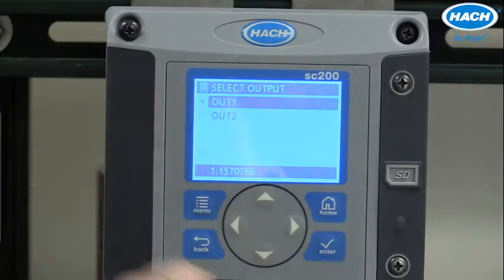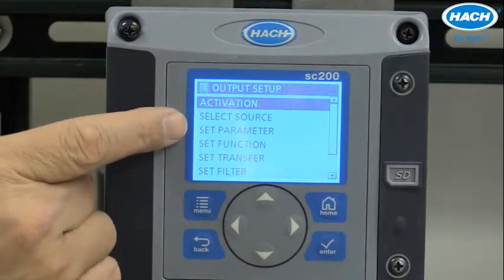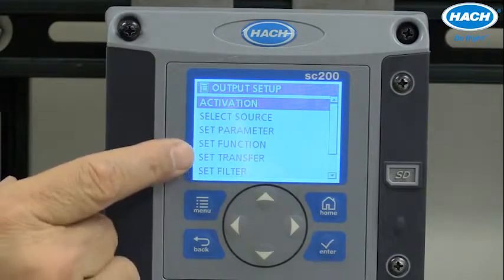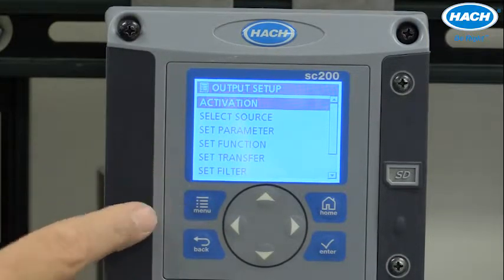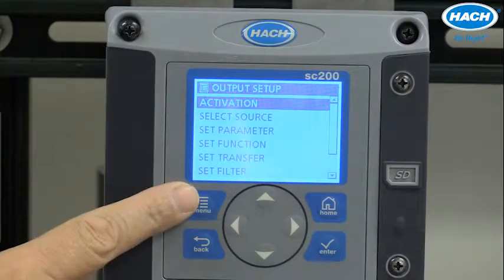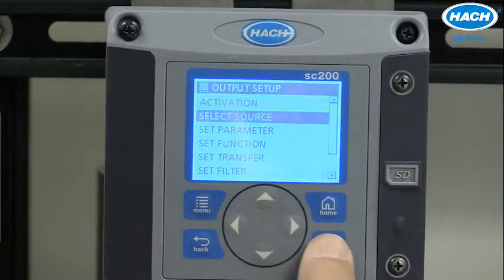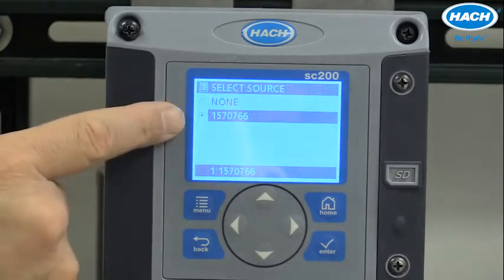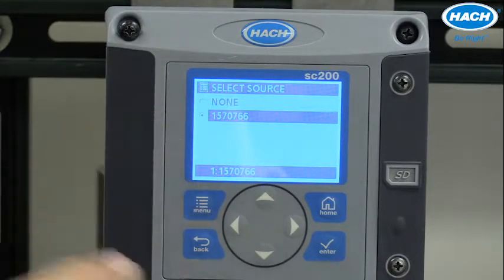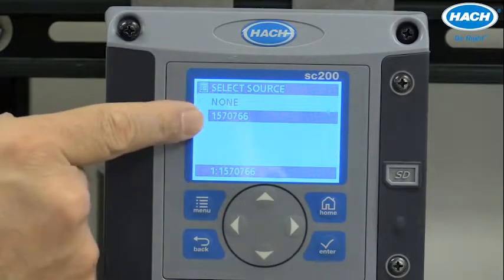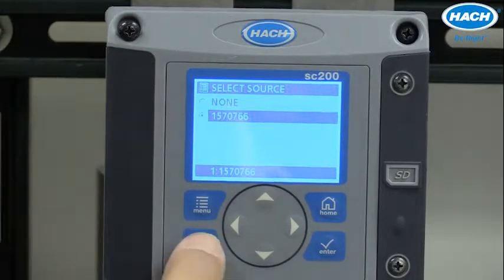So Output 1 we will configure. Activation, select source, set parameter, set function, transfer, and filter are all different ways we configure the output. The source allows you to select which device you want the output to monitor. In this case, the serial number of the turbinimeter is appropriate.